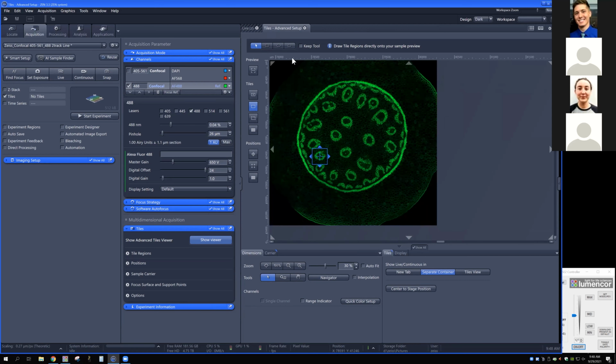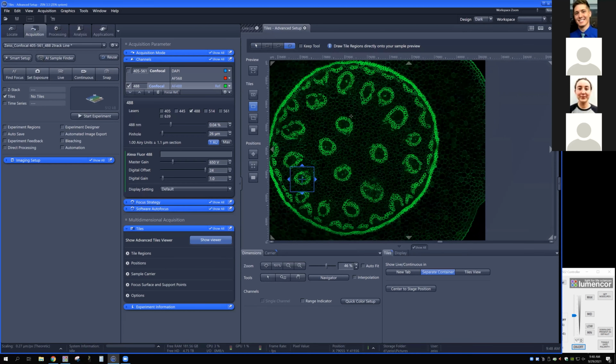And this is one that I was showing yesterday, I think in the morning, because someone had a question about it, which is that if I wanted to, I can get very specific and I can use this pencil tool and I can draw exactly the region that I want. Let's say I want to get this region and this region right here. So I can draw exactly that when I want to, and then let go, and right click. No matter where I am, I can right click and it'll close the entire area for me. Now, keep in mind that it's only going to do the squares that the scan is. So I can take a lot of time to do that, but it's really just going to give me whatever squares it takes to encompass that area.